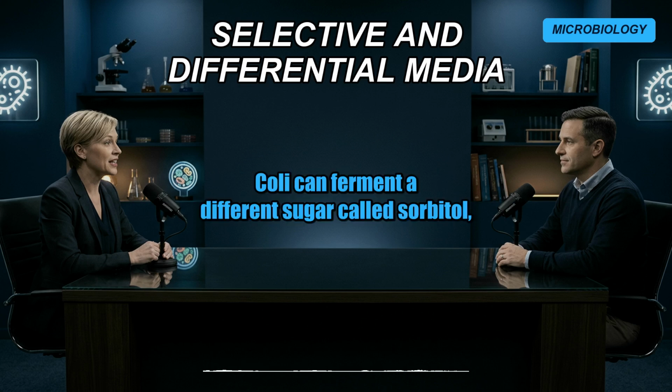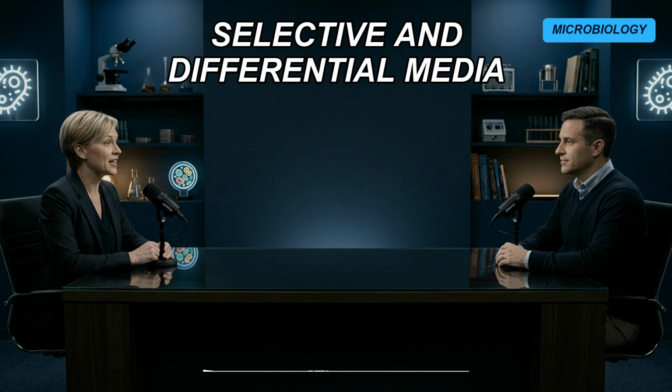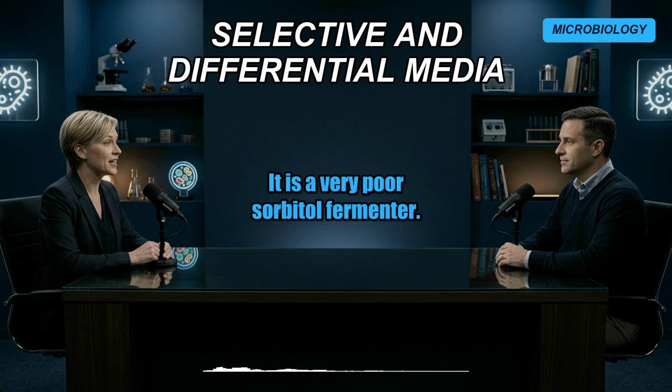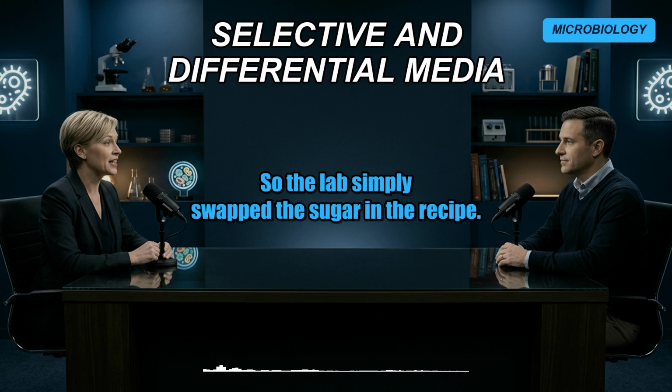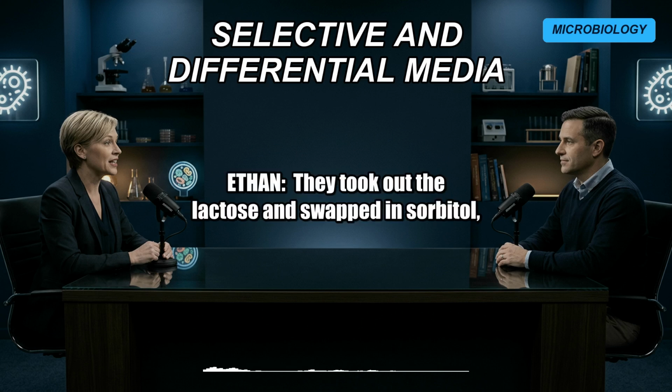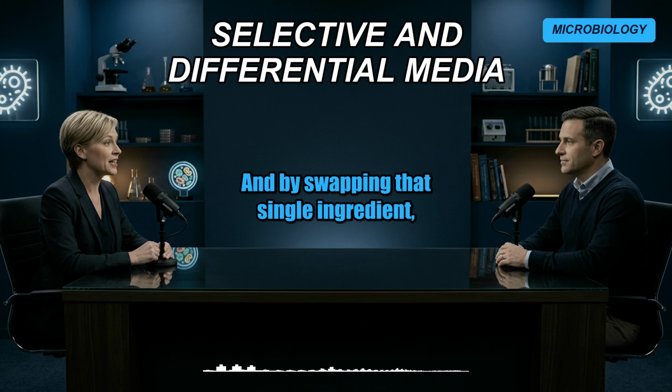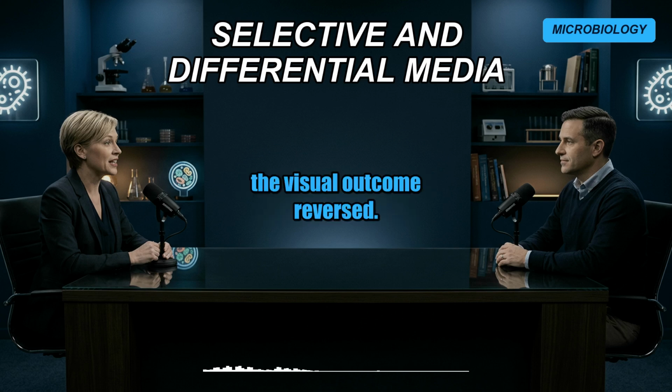coli can ferment a different sugar called sorbitol, the deadly O157 strain cannot. It is a very poor sorbitol fermenter, so the lab simply swapped the sugar in the recipe. They took out the lactose and swapped in sorbitol, creating sorbitol MacConkey agar. Yep. And by swapping that single ingredient, the visual outcome reversed.